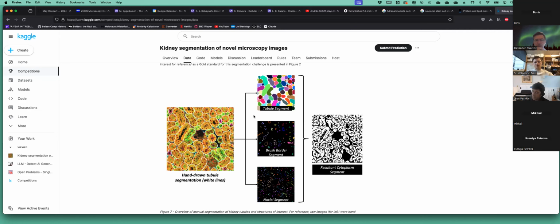So, on one hand, I don't think that this is a deep learning application. If anything, we need... Again, I might not be current, but I think we need much more data in order to just throw it at a deep learning approach. So I expect somebody who understands how this is done would manually build a convolutional neural net architecture, which would reflect the domain, and then train it.